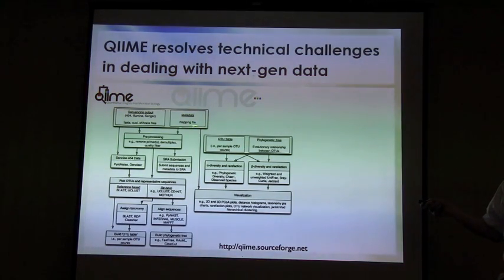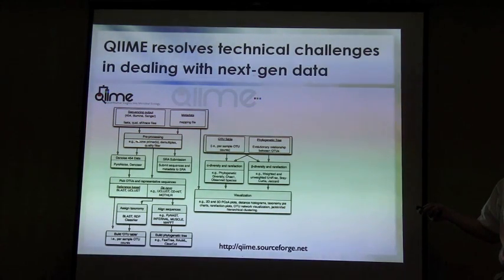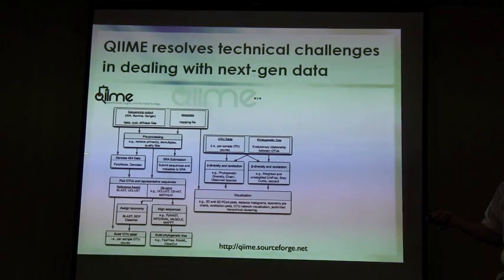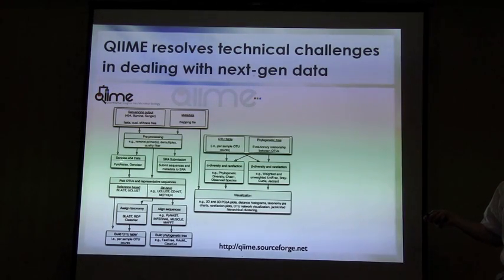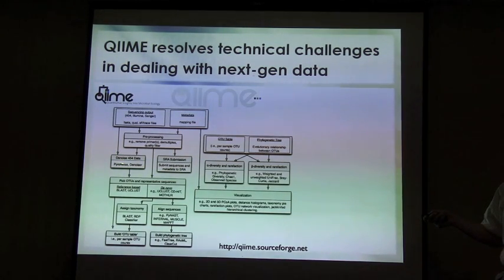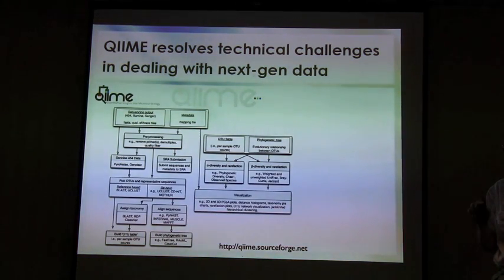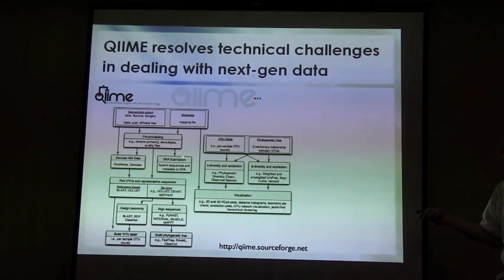So basically, starting from the output of the sequencing machine and from the metadata, which I will talk more about tomorrow, we do pre-processing, including primer removal, demultiplexing, quality filtering. You can do denoising, although depending on your analysis, you might or might not need to do that. So for alpha diversity numbers, where you care about absolute estimates of, say, how many species were in the sample, you care a lot about denoising. But if you care about overall patterns of community similarity, it's not so important.